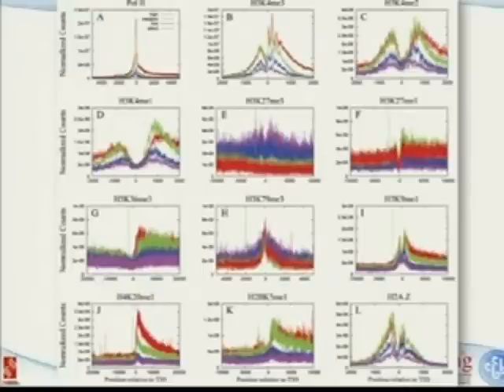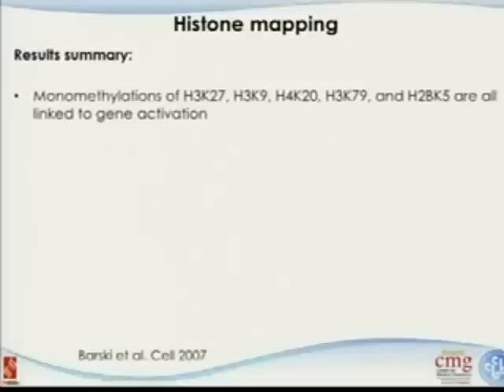So you can see that we did observe a very strong signal of RNA polymerase II around the transcription start site of the gene. This is not really surprising. But for the other data, this is probably the first time that we have the opportunity to observe that. For example, this is what histone 3 K4 trimethylation binding pattern should look like around the transcription start site of the gene. And this is dimethylation, monomethylation, and there are different histone markers, like histone 3 K36, and for different markers, what they should look like on a genome-wide scale. This is probably the first time that this has been really mapped.